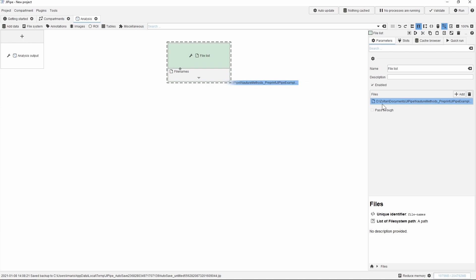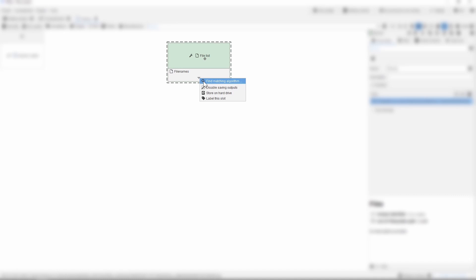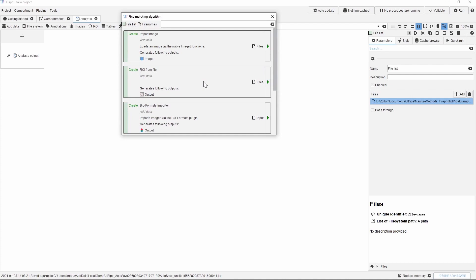We now have to convert our file path into an image, which is then accomplished by another node called Import Image. You will find all available nodes via the menu or the search bar. If you are not familiar with the Jipipe nodes, you can use the algorithm finder. This will list all the compatible processing steps for a specific output. This list will then reveal all the available options and the top choice is the Import Image node.